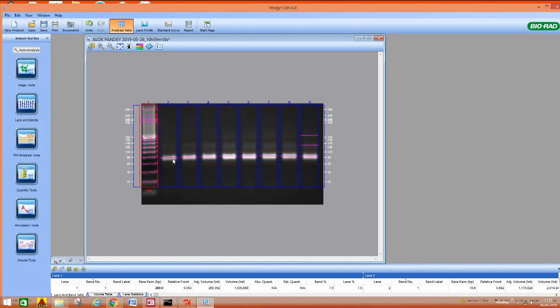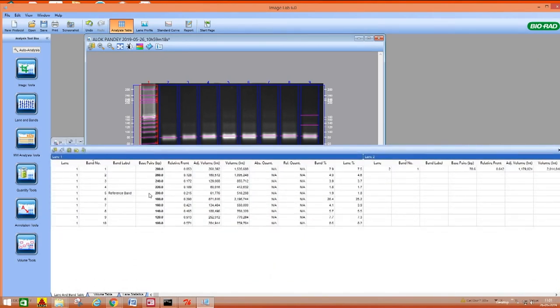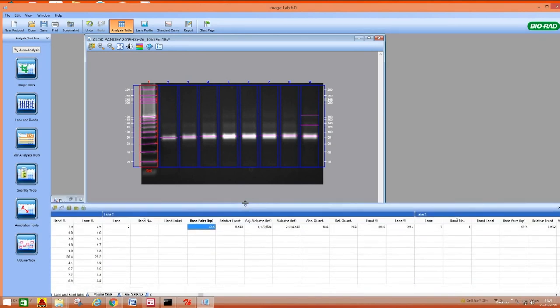So the next thing is, after being completed, you need not specifically look into what this band corresponds to. You just go to lane 2 values. This is lane 1, this is lane 2. Only single band we are predicting, that belongs to 78.6 base pair value. This is in lane 2. So as you can see, this is 80 and here it is coming, this is 78.6 base pairs. So in this way you can calculate the molecular weight of the nucleic acids also.